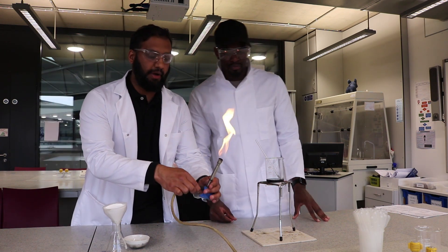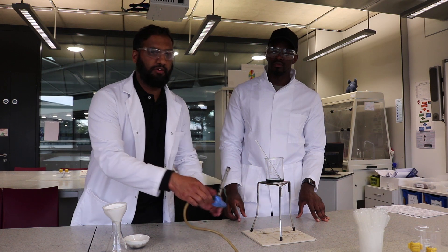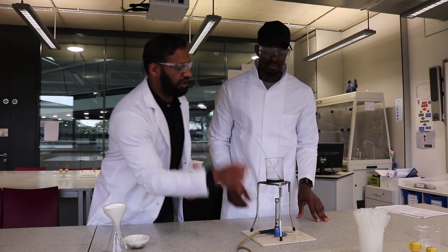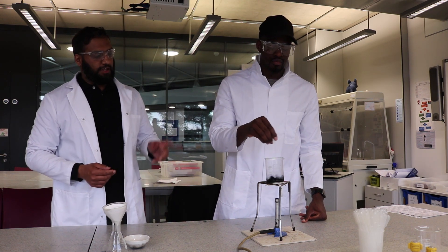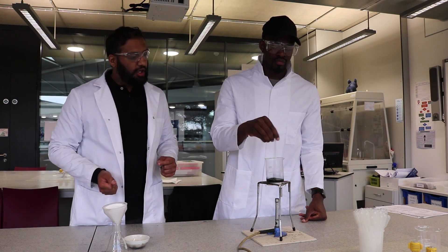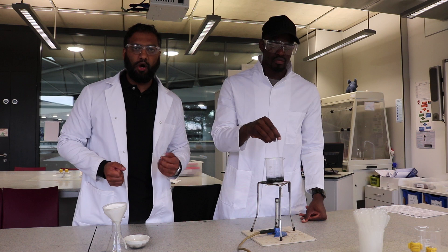Remember the safety rules: start with a yellow safety flame, then move to a blue flame. We're heating and stirring for about 45 seconds to a minute, just making sure all the acid is being used up by the excess copper oxide.